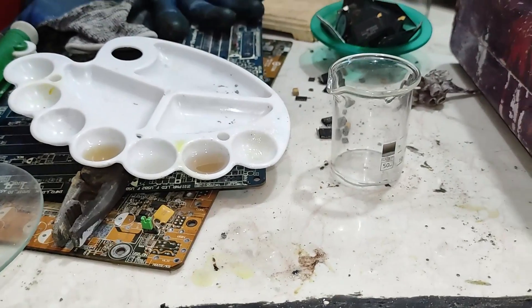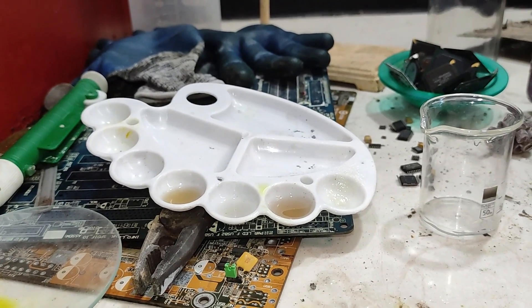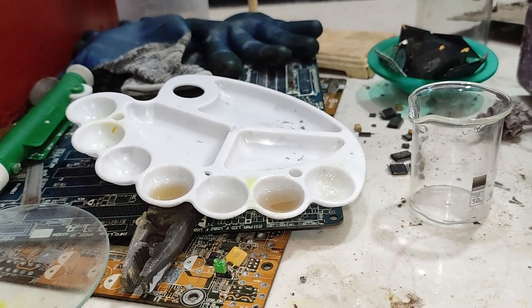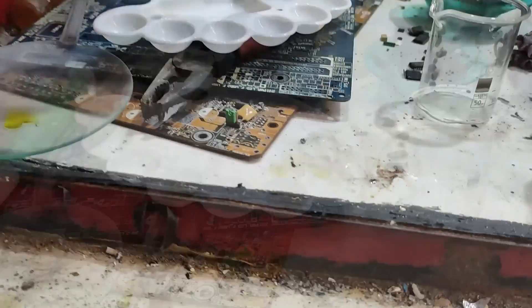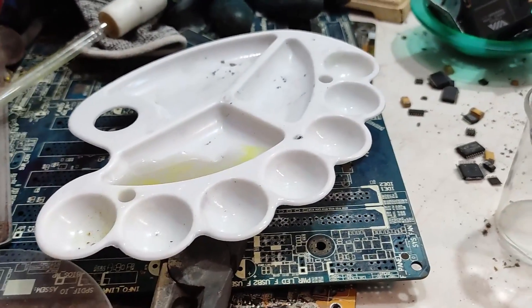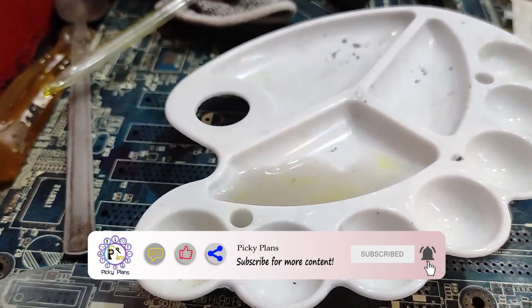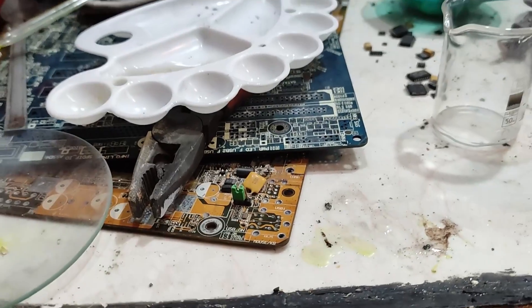It seems like a good ore to be processed. Next time, once I've made my furnace, I will take a sample from that ore and process it in a totally different way using the industrial method with lead and cupels. I know it's a difficult way to determine all gold content, but I just needed to confirm the presence of gold — and as you saw, it was certainly a positive test. I consider this a green light to process this ore next time using a furnace and cupellation method.